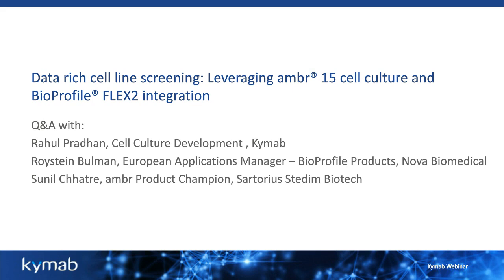Thank you very much, Sunil. That was really useful to know. A question for Nova. Is the OPC module necessary for connectivity between FLEX2 and ambr? No, OPC is not required for connectivity between FLEX2 and ambr.